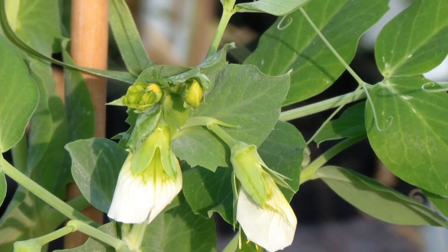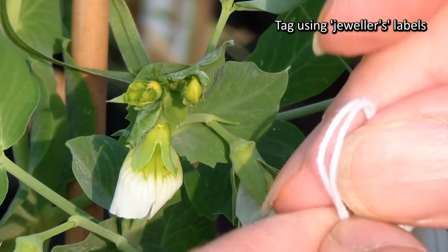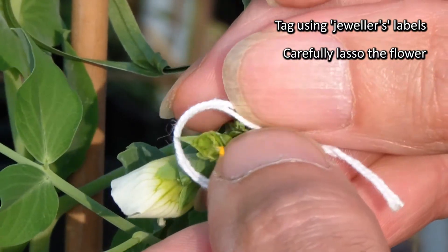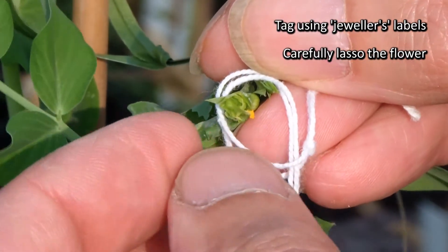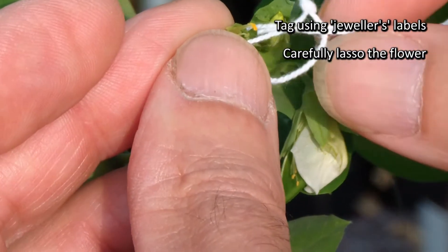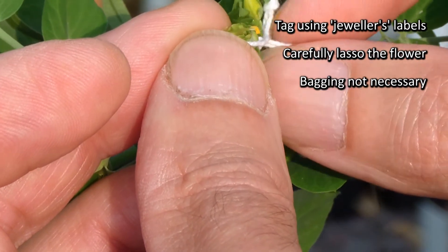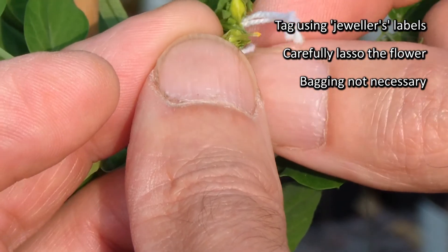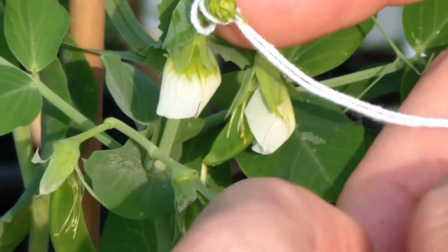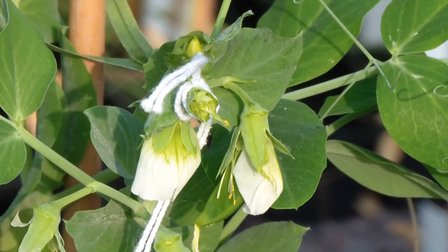The flower there is ready for tagging using these jeweller's tags. The bud is quite delicate so you want to hold it and lasso it carefully, drawing the string around the base of that flower. Clearly only one flower has been crossed — no need to bag it, it's not going to be visited and you won't get pollen on it now. The information of the cross is put onto the label. And that's it — crossed pea flower.